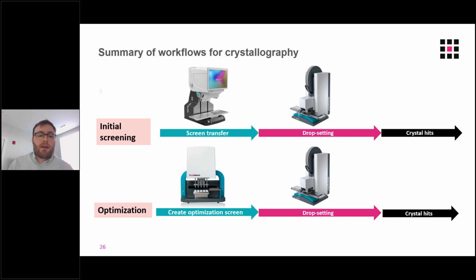You can make 4 or 5 different optimization plates in a matter of like 15 to 20 minutes if you wanted to, and you can test all of those on the Mosquito very easily. Once you've created these plates, you could set them up in slightly larger plates, like a 1 mL condition plate, and then stamp them out from an Apricot, so you are using the same source plates each time.